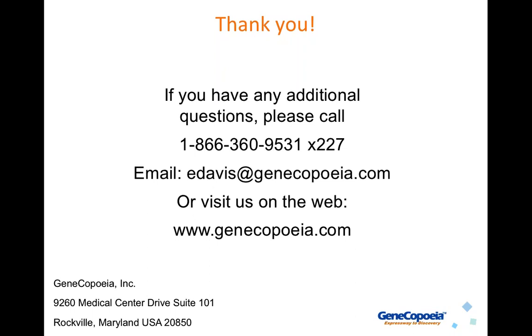Okay, next question. Do you have any tips for designing sgRNA for knockout using long non-coding regions? Yeah, that's a good question. There's been a lot of interest lately in knocking out long non-coding RNA and coding genes. Usually, we recommend using two guide RNAs that will delete all or most of the lncRNA sequence. But that's something we can talk about if you're interested and if you want to contact me.